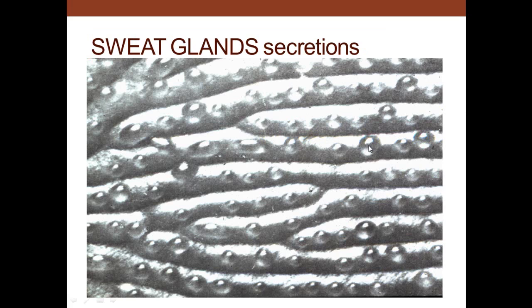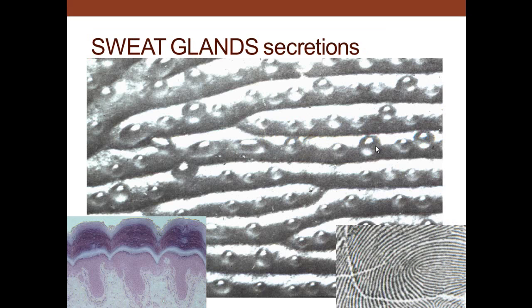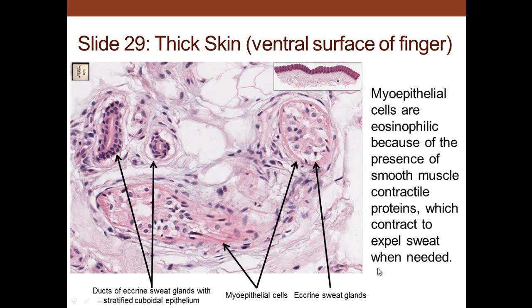And you can see where a typical common sweat gland discharges at different places along the fingerprints. So you can see why you would leave fingerprints, because it's discharging right on these grooves. And the surface of these grooves, of course, is the abundance of cells in the epidermal pegs that project down into the dermis and pile up on the surface. And these piles that we see there, with the sweat discharge on them, leave our fingerprints.